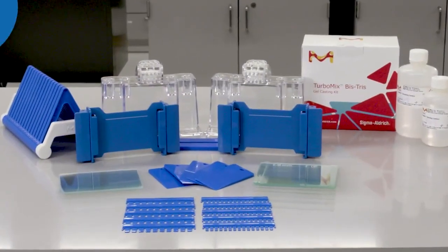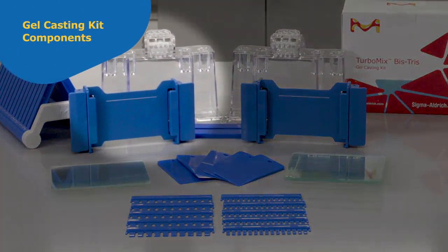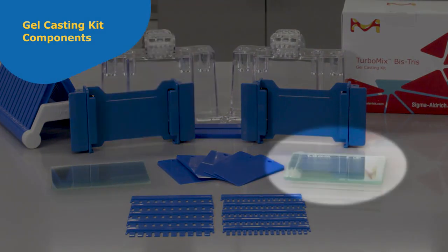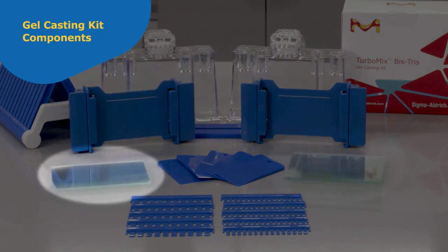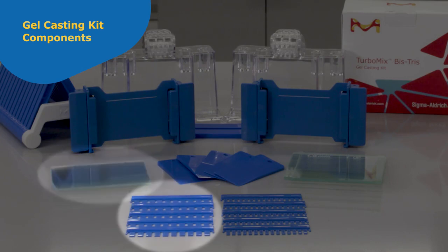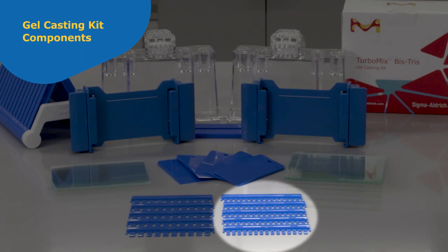The mPage Gelcasting Kits include the mPage Gelcaster along with five mini spacer plates, ten mini short plates, five 10-well format combs, and five 15-well format combs.